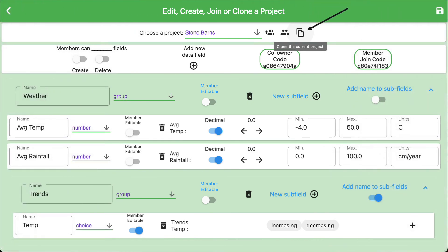Now that we have learned how to set up a project and assign samples to projects, let's talk about a function built in to make your life easier. The third icon on the project management screen enables cloning of a project. Suppose you have a project that you've been working on and you've set up all the fields you like, but now you've been tasked with managing another similar farm or garden and you don't want to reinvent the wheel. Simply clone a project you like, add, delete, or modify fields, and you are ready to go.